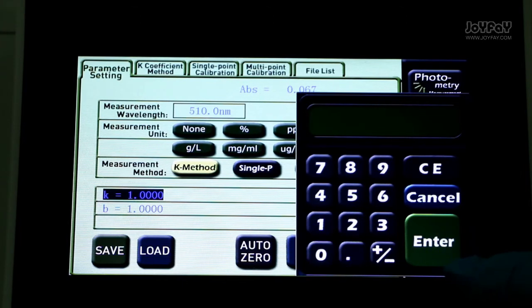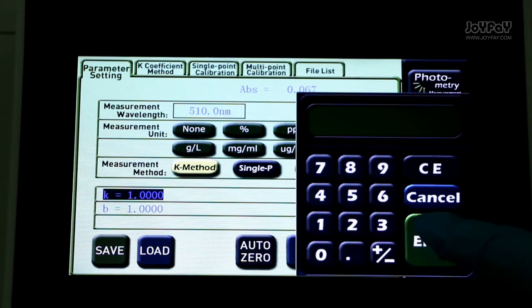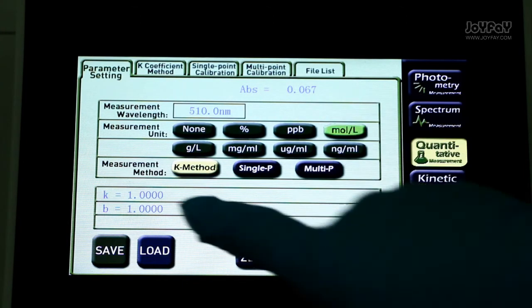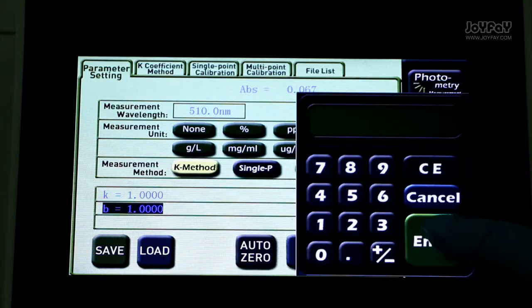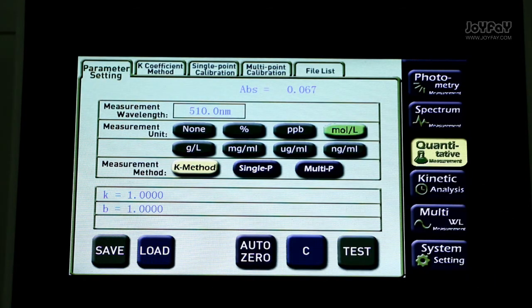If you choose k coefficient method, you need to enter k and b values. You can see the result in tag 2.